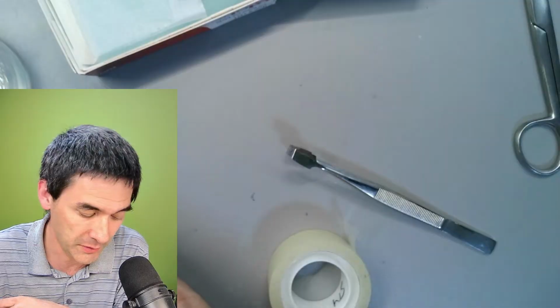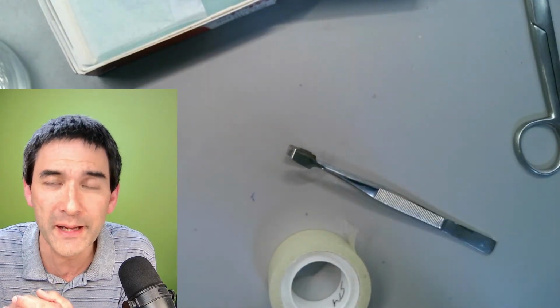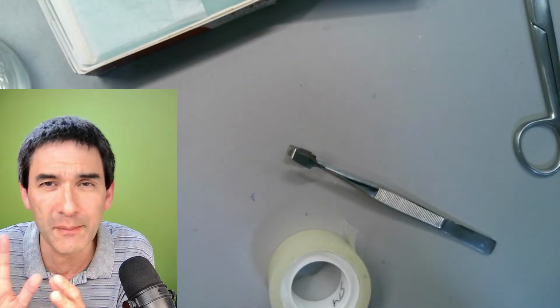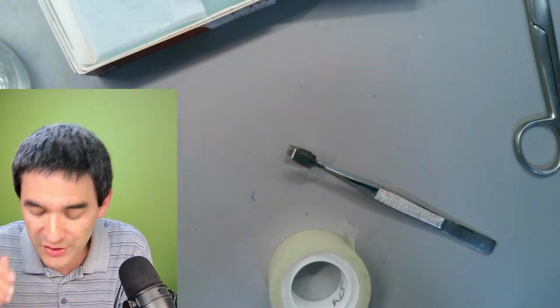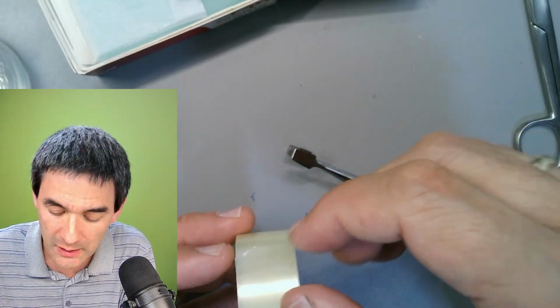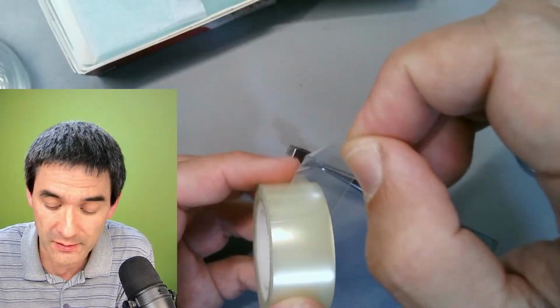Okay, because how likely are you able to find face mites? Well, today I was able to find 4, 5, 6 face mites, and I made approximately 10 slides. So about 50% success rate. Right? And considering the fact that it's quite fast and easy to actually extract them, you should be able to find one in a couple of minutes.